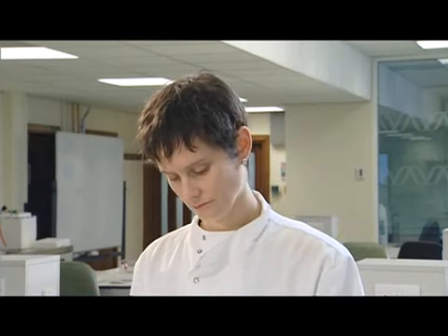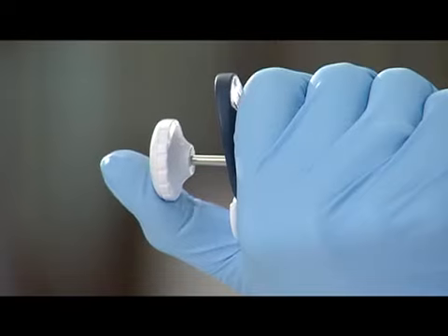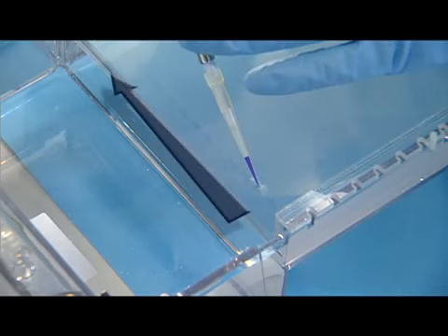Before you pipette the sample into the well, make sure there's no air bubble at the end of the tip. If a bubble is present, gently push down on the push button until the air bubble is gone. Since the wells are rectangular, keep the pipette parallel to the row of wells when loading the samples. This orientation reduces the possibility of accidentally stabbing the walls of the wells. The tip of your pipette should be just inside or just above the well, but not touching either side or the bottom of the well.